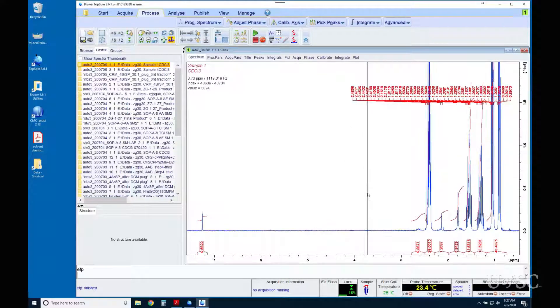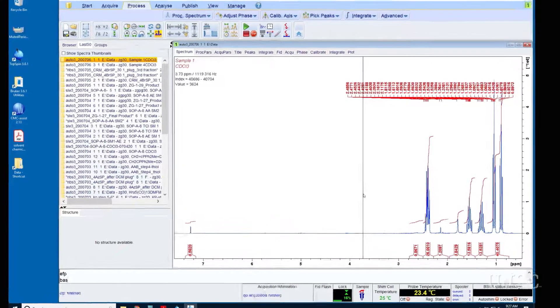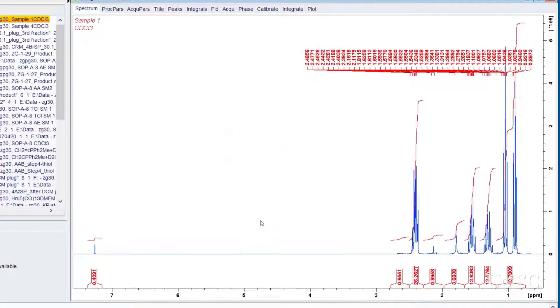For more accurate integrals you should then correct the baseline with the BAS command. Type BAS in the command line and after you hit return a dialog box will open. Make sure the auto correct baseline using polynomial radio button is selected. All other parameters can be left with their defaults.